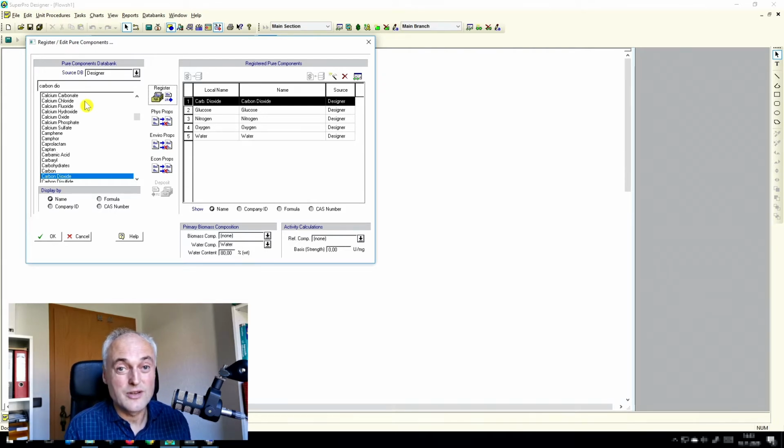I don't even know the composition exactly. And the cool thing is, we don't care about the exact composition. We just need to know this is an organic soluble compound, full stop: distiller soluble. At that point, we handle distiller soluble as being similar to glucose. For us, it's a substance.